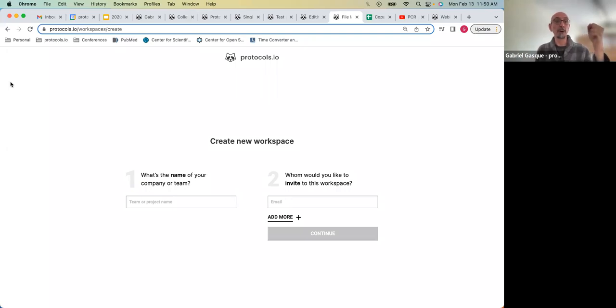So people in workspace 2 won't see what is happening in workspace 1 and vice versa. And some people can be in both workspaces. Each workspace can have a subset of overlapping documents, but they could also have independent documents that are not shared among the 2 workspaces. Did I answer your question, Mohammed?